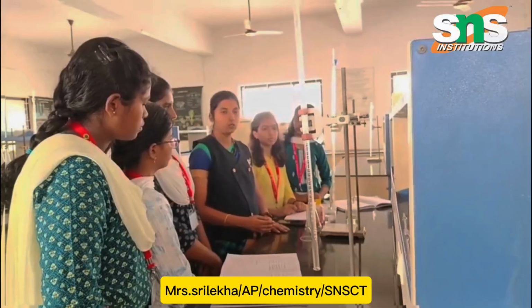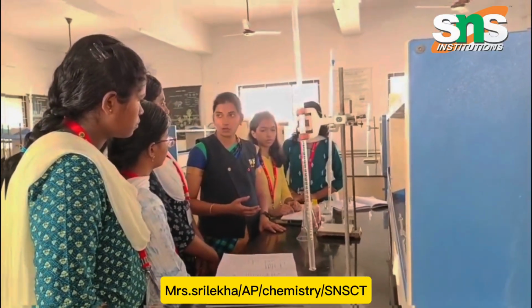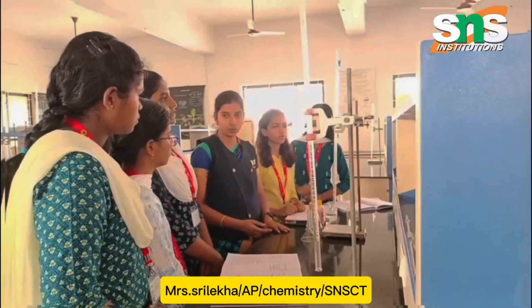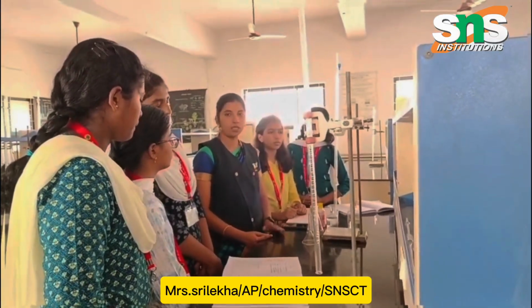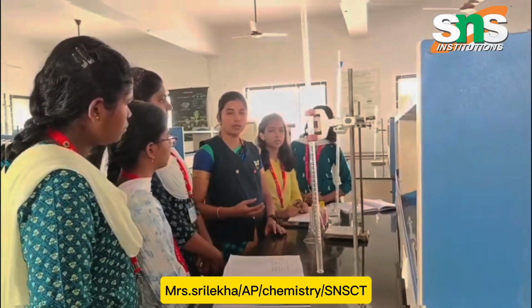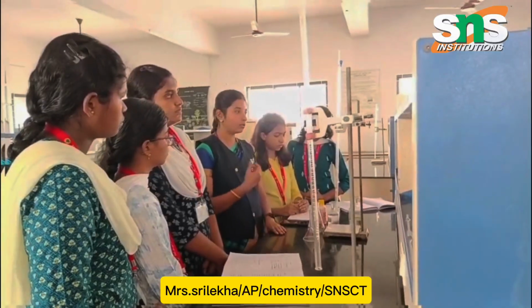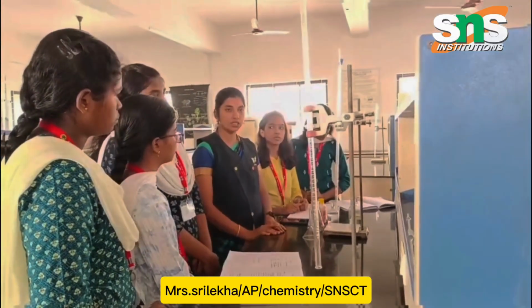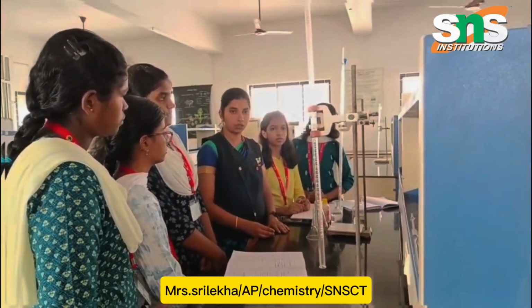Okay. What indicator are we adding to indicate the end point of the reactions? Phenolphthalein and methyl orange. Phenolphthalein gives a pink color, and by titrating it with the burette solution of HCl, the pink color disappears. What is the second titration indicator? Methyl orange. When we add methyl orange, it shows a yellowish color, and while titrating, it changes to a reddish orange. It indicates the end point of the reaction, whether it is alkalinity, hydroxide or carbonates in the solution.